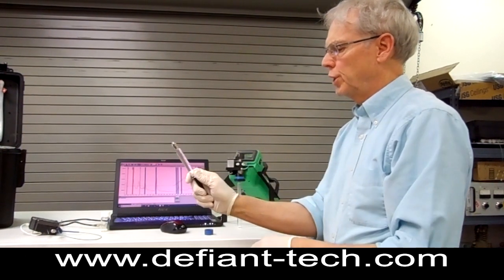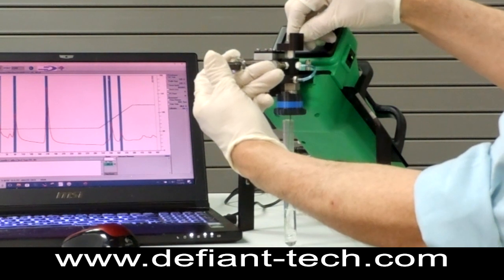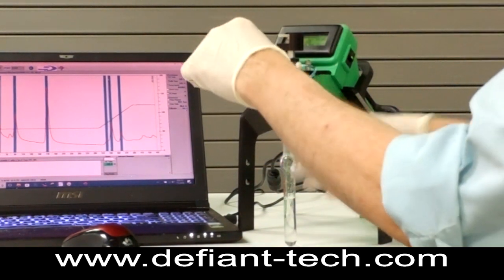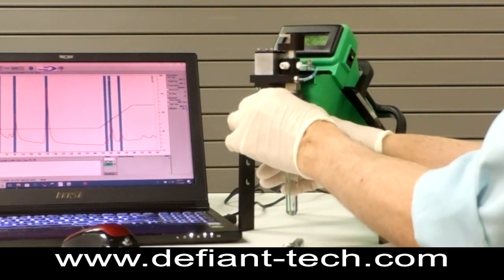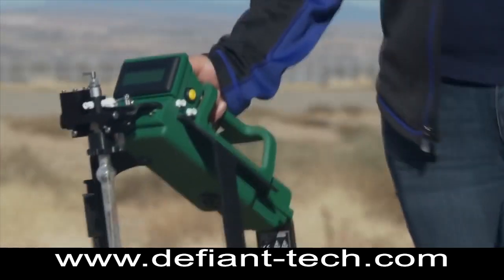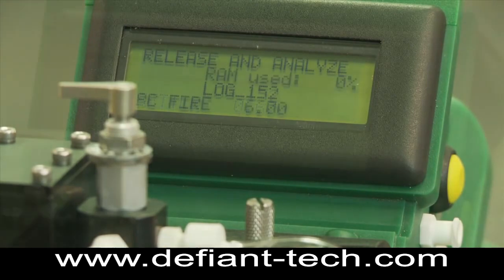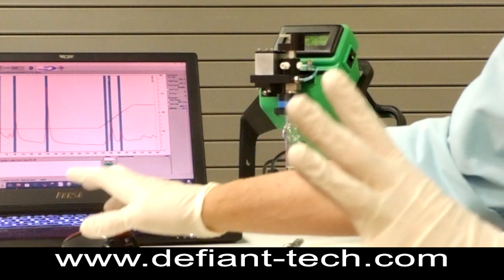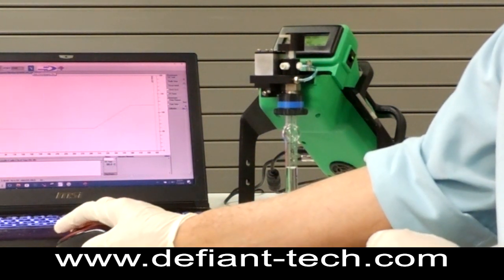And then push it up to five milliliters. We'll load the sample up, rotate this over to run water, and then bring the sparge bottle off. If you're running in the field, you don't have to be hooked up to a computer — just press the button right here and it will start and give you the results right on the display. But since we're making a video here, I'm going to hit the start button right here.